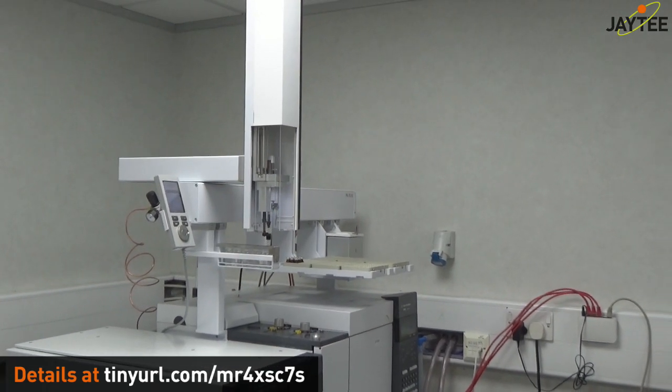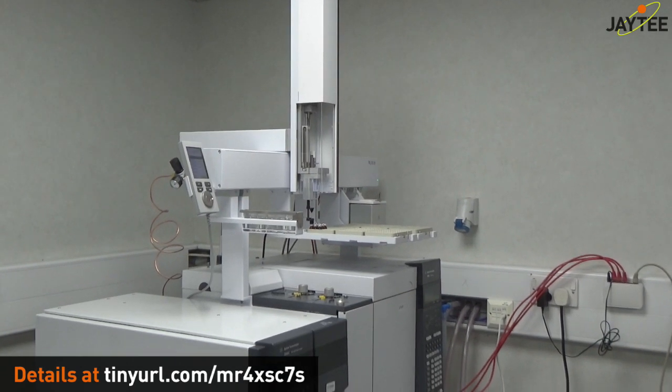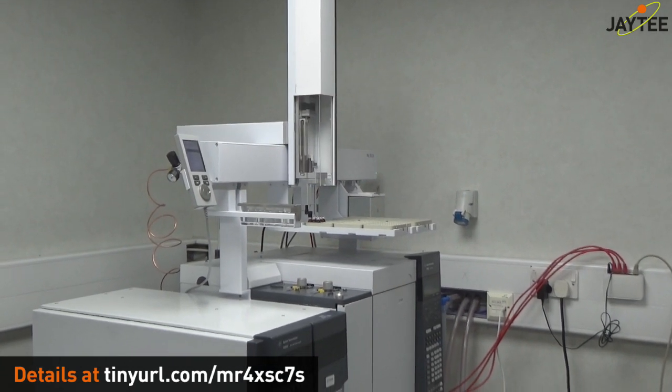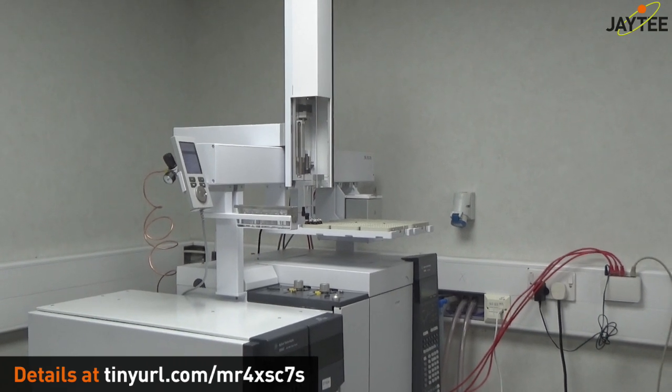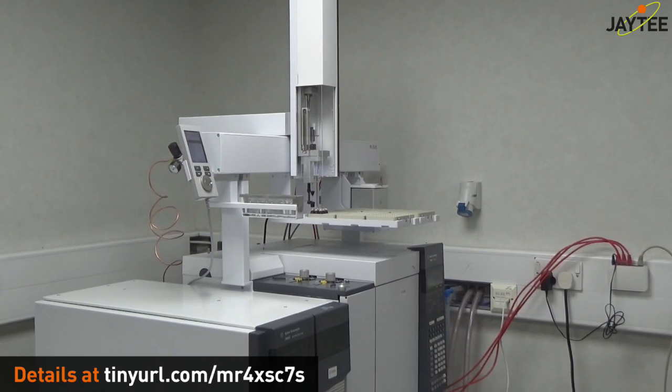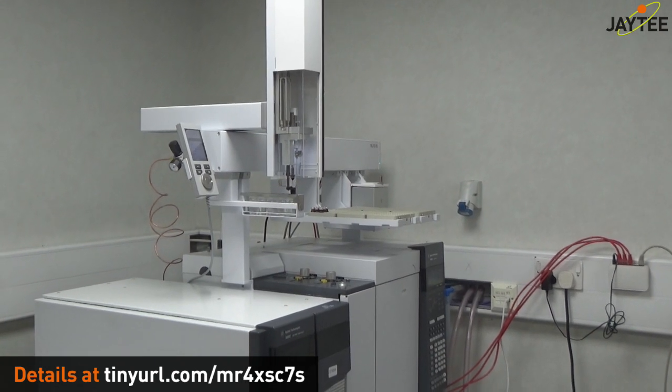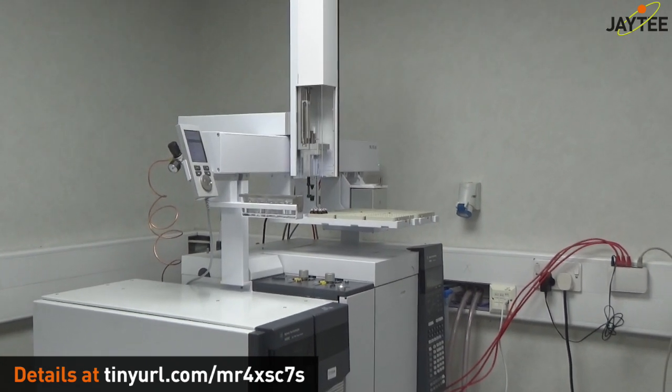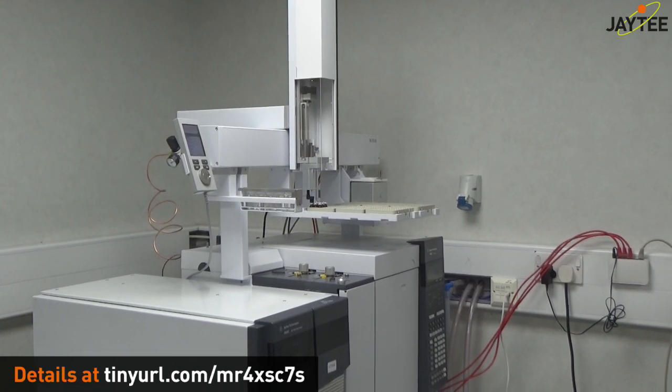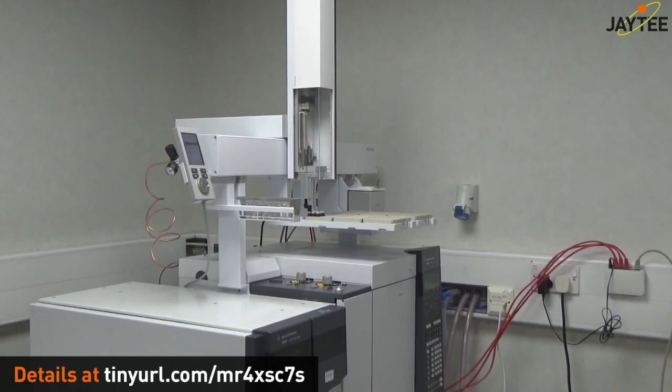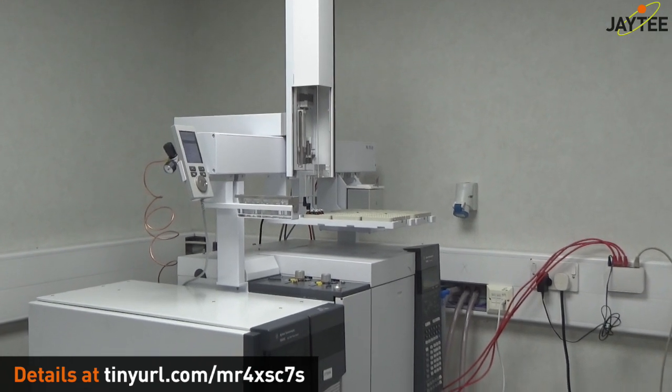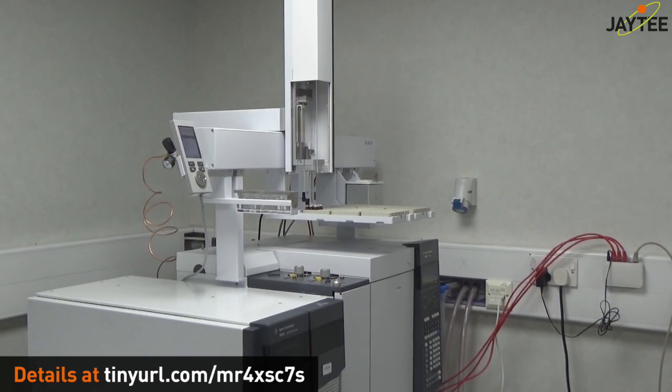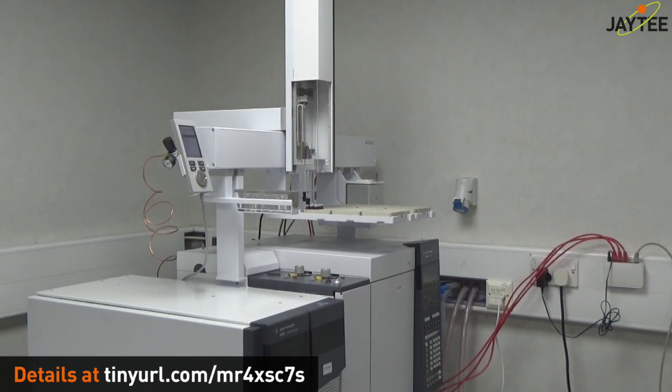So what JT can do for yourself, they obviously can do all the installation, they can also do all the servicing in future years for you. And I can, to help you along, offer you method development, developing the methods that you need, and particularly determining the various MRM transitions for the chromatography that you require for either known or even unknown compounds using the collision scan.